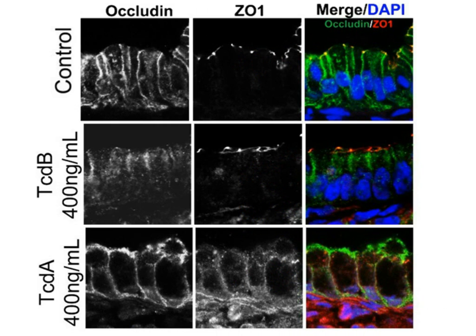We looked at additional cell junctional proteins. So we looked at occludin and ZO1, both of which are important for cell-cell adhesion and for tight junctions. And again, consistent with our functional data, for example, looking at ZO1, we really didn't see that much of a difference in the apical tight junction marker ZO1. But when we looked in the toxin A treated organoids at the bottom, we could see a really dramatic redistribution of this protein so that it really wasn't present at the top of the cells in those nice punctate spots.